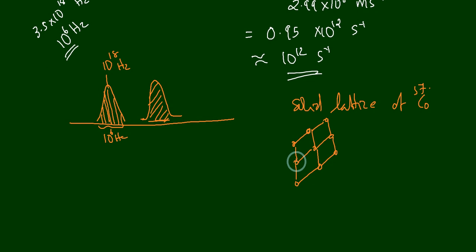The thermal motion of the lattice atoms is reduced to a minimum. In order to ensure that this thermal motion of the lattice atoms is very much reduced, he also used a very low temperature. You can use liquid helium or liquid nitrogen. If you are operating at a very low temperature, whatever is possible, then the thermal motion of these lattice atoms will be minimized and restricted, so that the recoil can be stopped. The recoil of the source nucleus can be stopped.